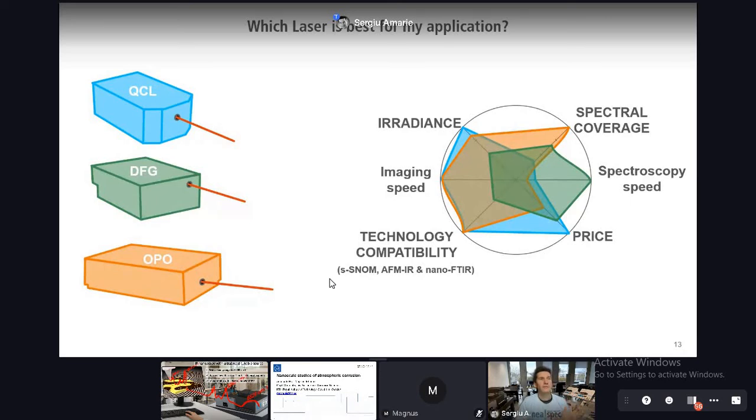Very good question. Is the OPO used for the pseudo-heterodyne detection module? Do you need to change the mirror modulation amplitude during the wave number tuning for spectroscopy? Two very good questions, and let me go to the proper slide over here.